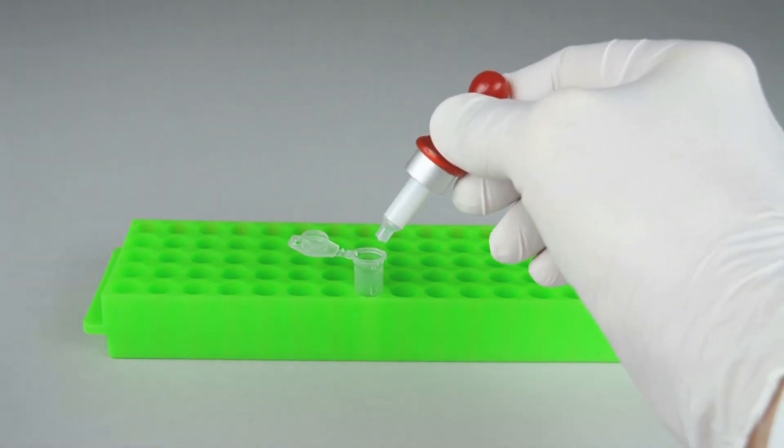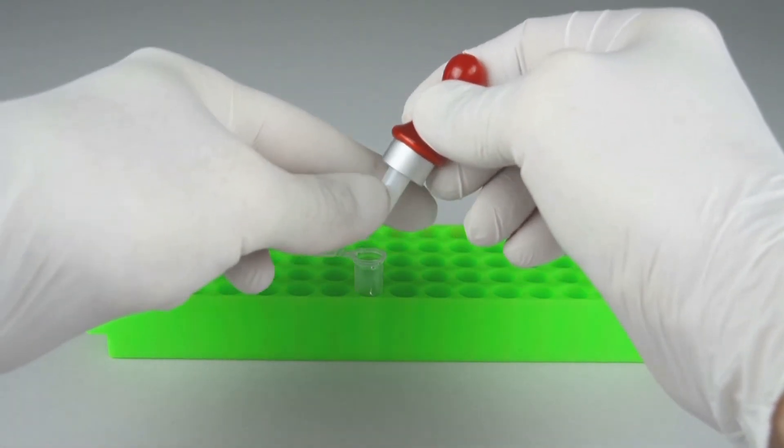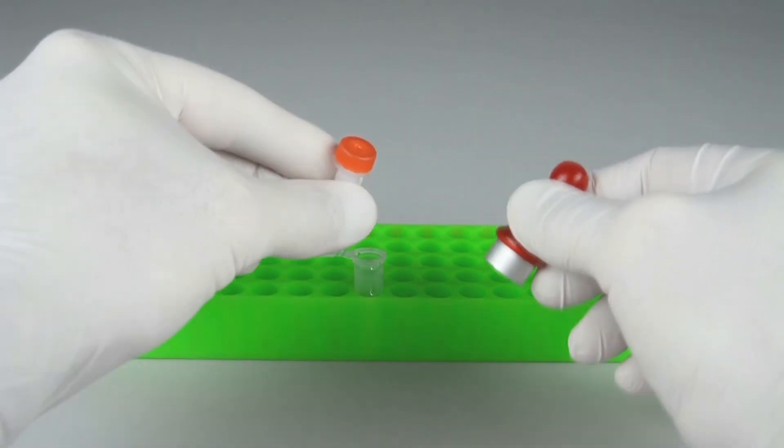Then simply detach the cap puncher by twisting off clockwise. As you can see, the column cap has been pierced.